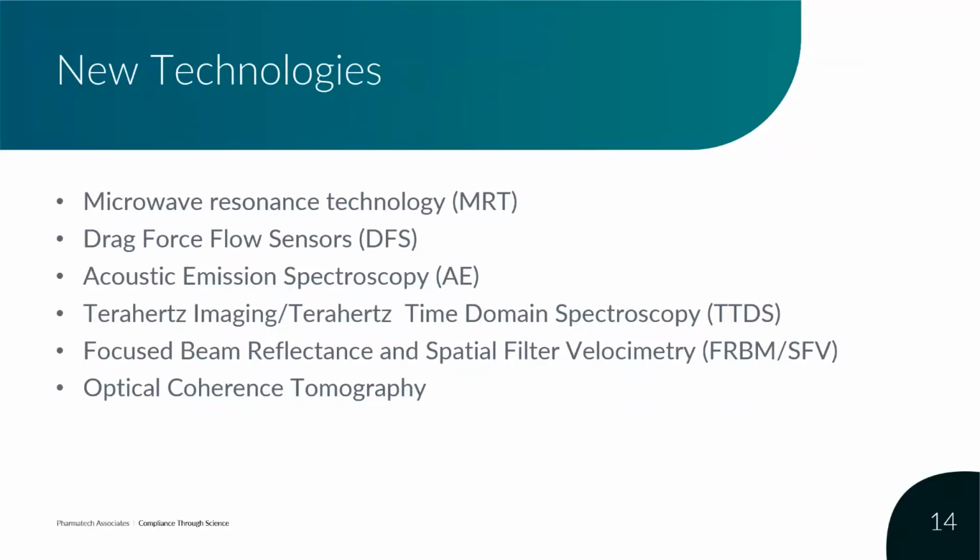And of course, the density of a wet granulation is going to affect particle size, porosity, etc., which are going to directly impact your finished product properties. Again, primarily, especially dissolution. That's the first thing that comes to mind. Acoustic emission spectroscopy has been used in the past to quantify properties such as tablet thickness, mass, and other physical properties of the finished solid oral dosage form.